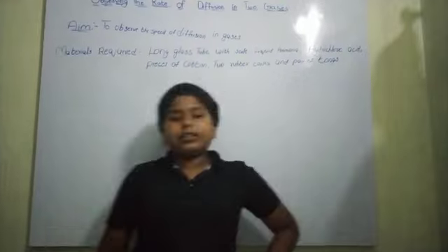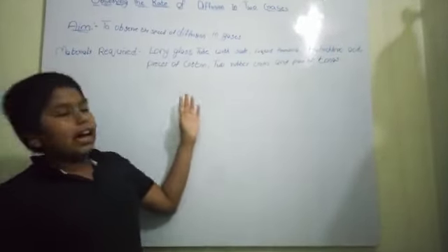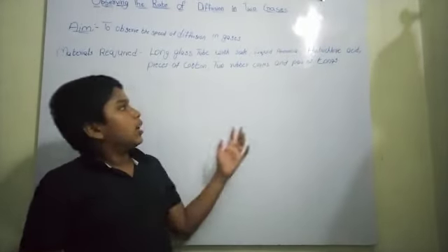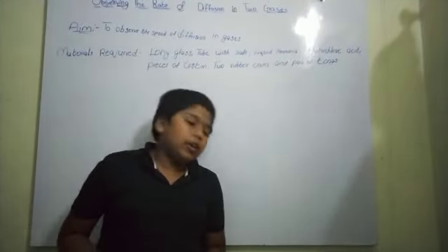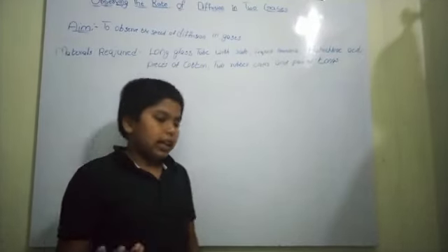The materials required to do this experiment are long glass tube with scale, liquid ammonia, hydrochloric acid, some pieces of cotton, two rubber corks and a pair of tongs. Now take a glass tube.